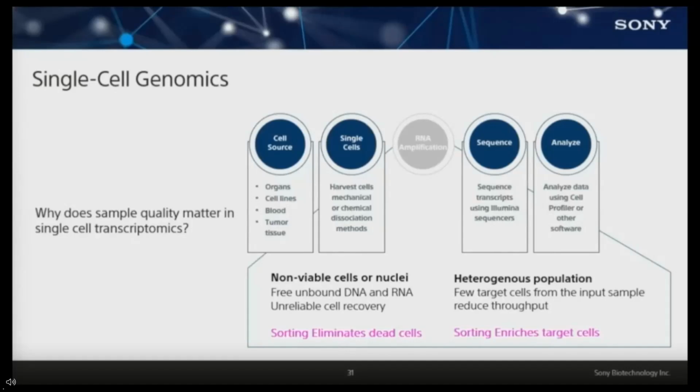what ends up happening is you have a couple things, right? And none of this is shocking. You have a lot of dead cells. You have a lot of debris. You have a lot of non-viable nuclei. So, that's really what you're looking for, right? And that's all because of the state of the tissue, the physical processing, enzymatic processing as well. So the idea here is you need to get rid of unbound DNA and RNA, and thus, have a clean sample, right?